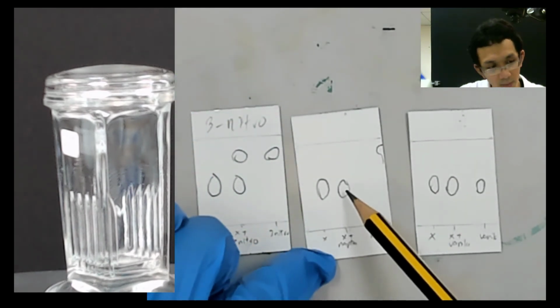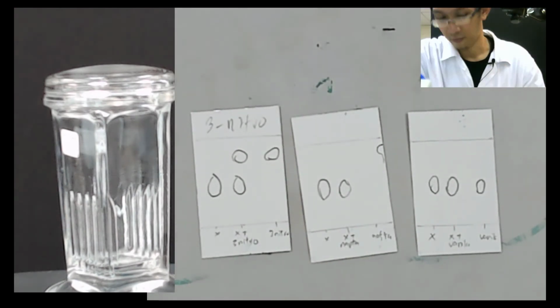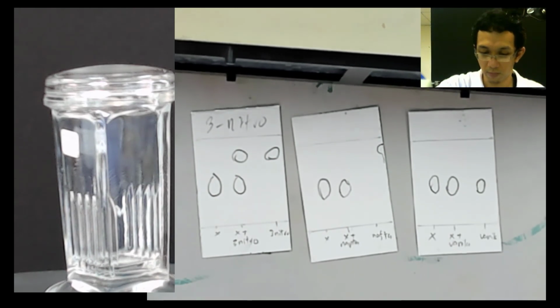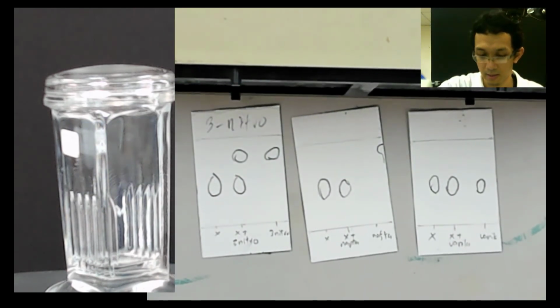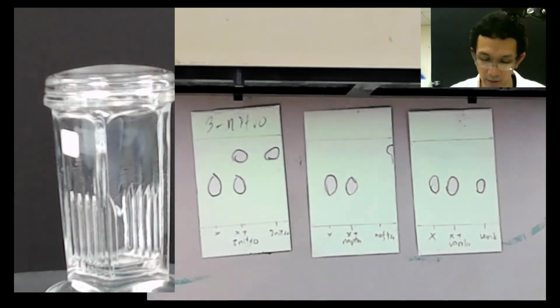So where is the thing? So maybe it goes far. Where is the other thing? Let me open this thing. Let me open this. Okay, there's nothing. So, okay, this is a problem here.